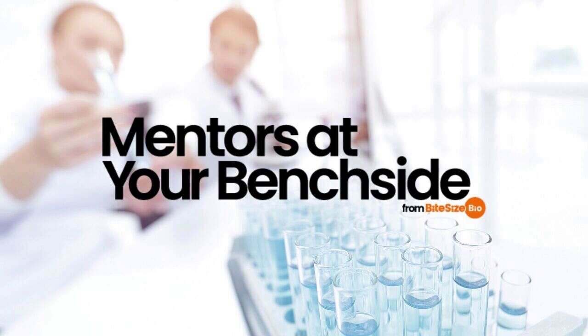Keep in mind that visual colocalization determination is influenced by many factors, including observer subjectivity, each individual's brain processing colours differently, possible colour blindness of the observer, and the spatial resolution determining pixel size. These are among many others, so be sure to process the images you're about to analyse uniformly, and remember that any uncontrolled manipulation may cause you to lose relevant information.